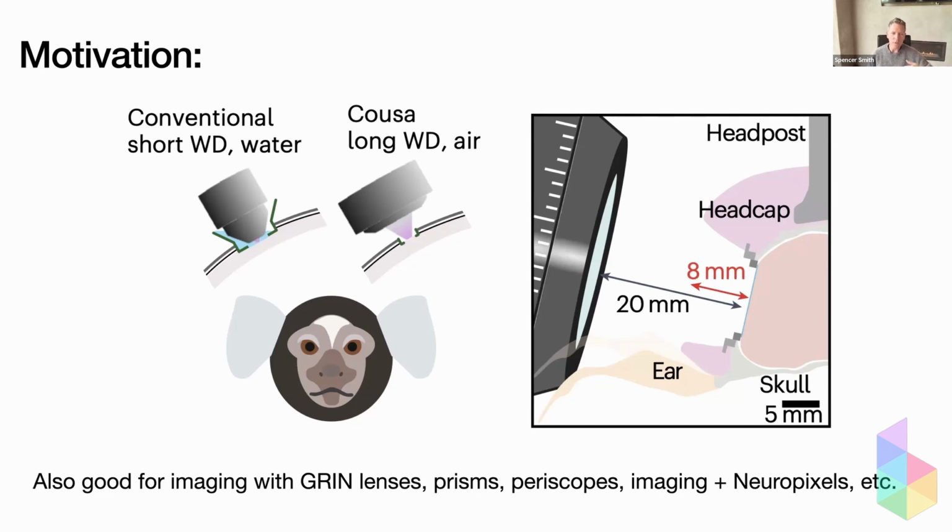One of the first things I realized in some of our experiments with custom optics for multiphoton was that air immersion worked. I thought that the spherical aberrations and these other issues would be crippling, but it turns out that it's actually fine. It works really well. And the ergonomic benefits are massive. So if you've got some experiment that's running for many hours, a water interface can shift over time, and you have to get back into the system and realign it. And with air immersion, you just don't have to deal with that at all.